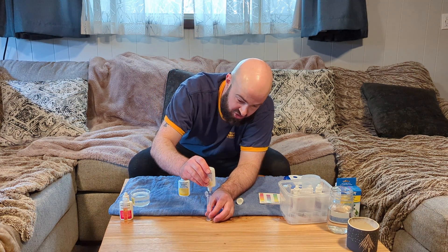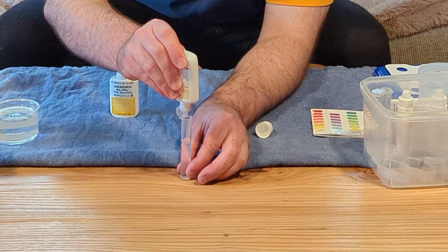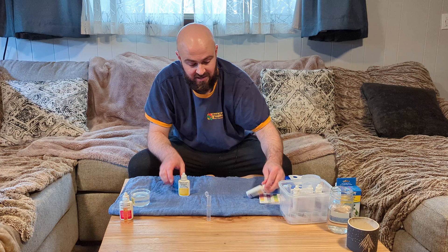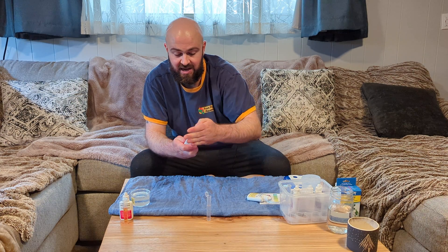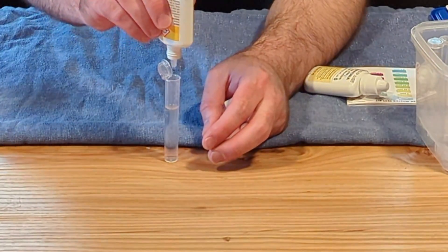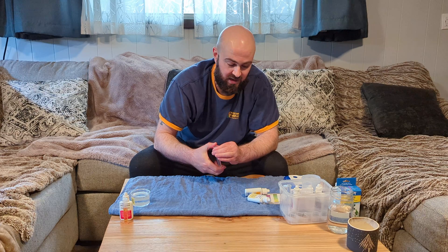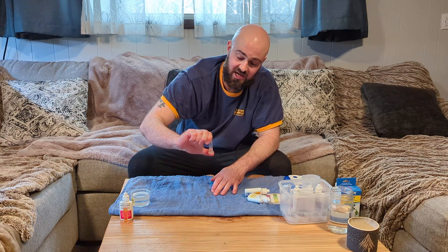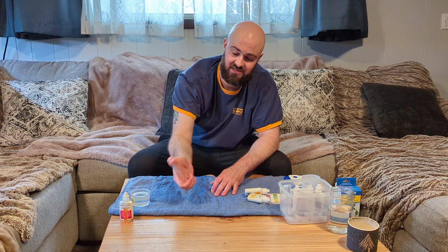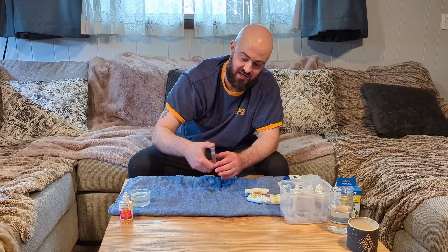Hold the dropper completely vertical and add eight drops of the first solution, then add eight drops of the second solution. Invert it a few times and wait five minutes.